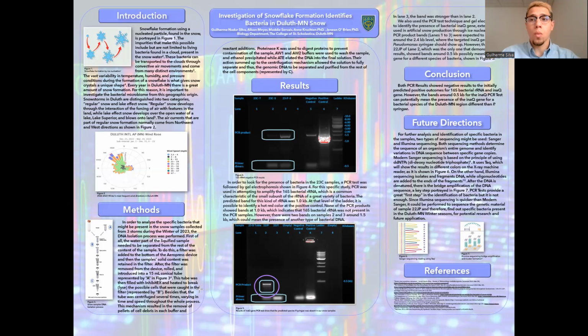And Illumina sequencing would give us the DNA sequence, the correct and specific one, which we could then search and successfully find the bacteria that was present here, and that is possibly present in a lot of our snow samples here in the region. And then these bacteria could be applied in different areas, and could have useful information about them, which would be really interesting for our region.